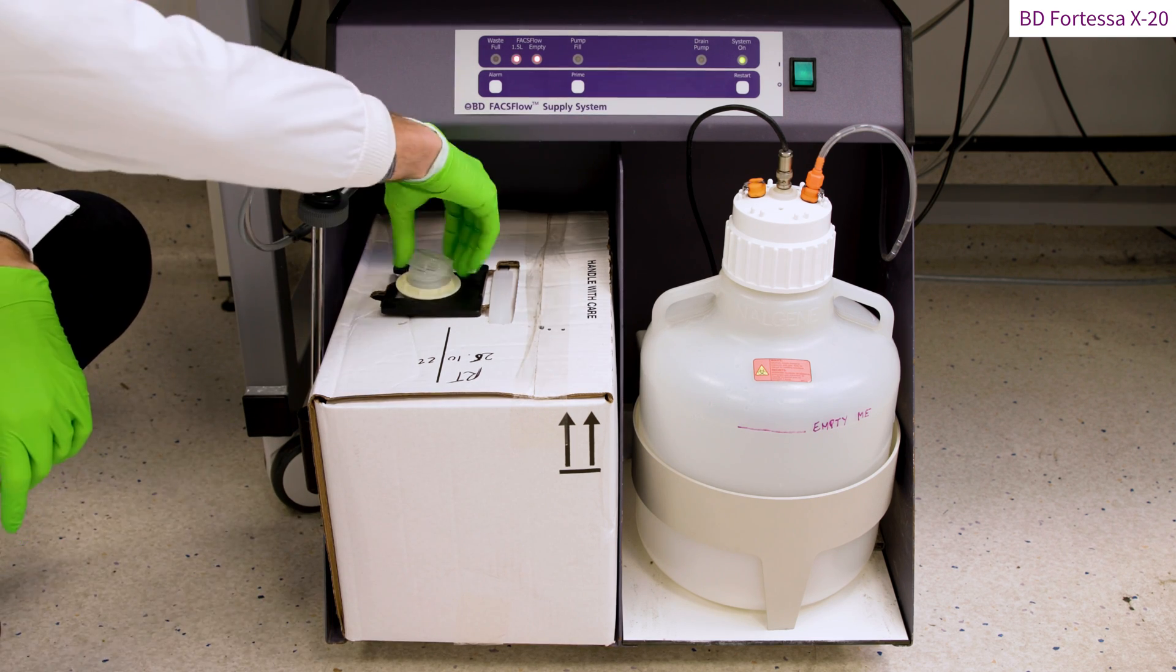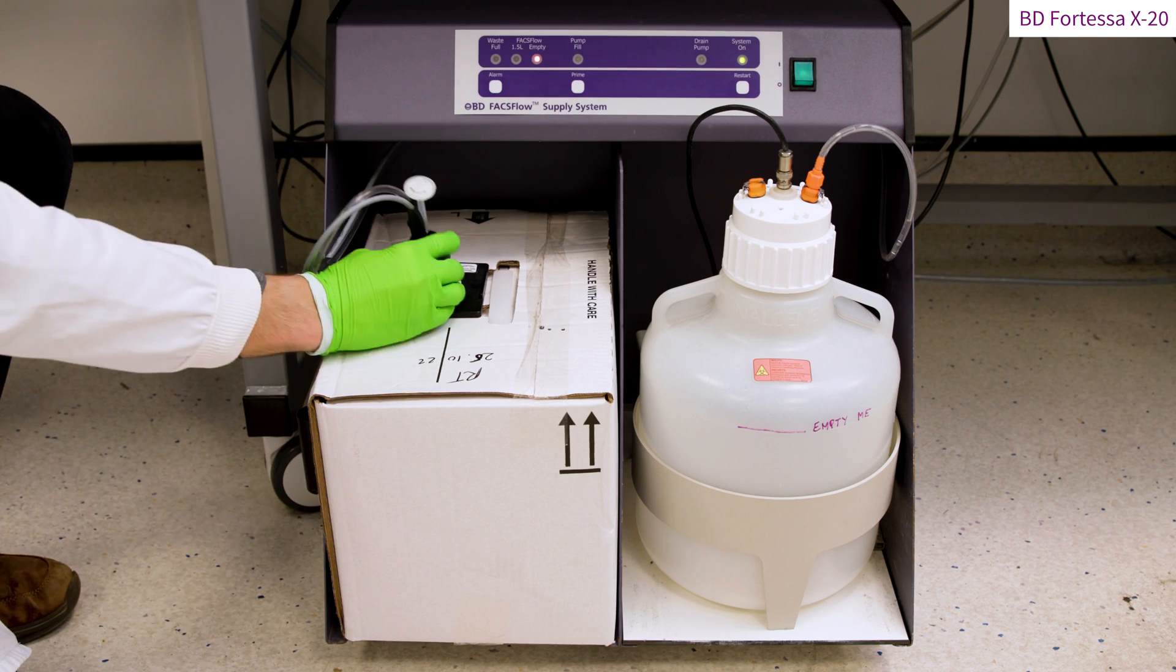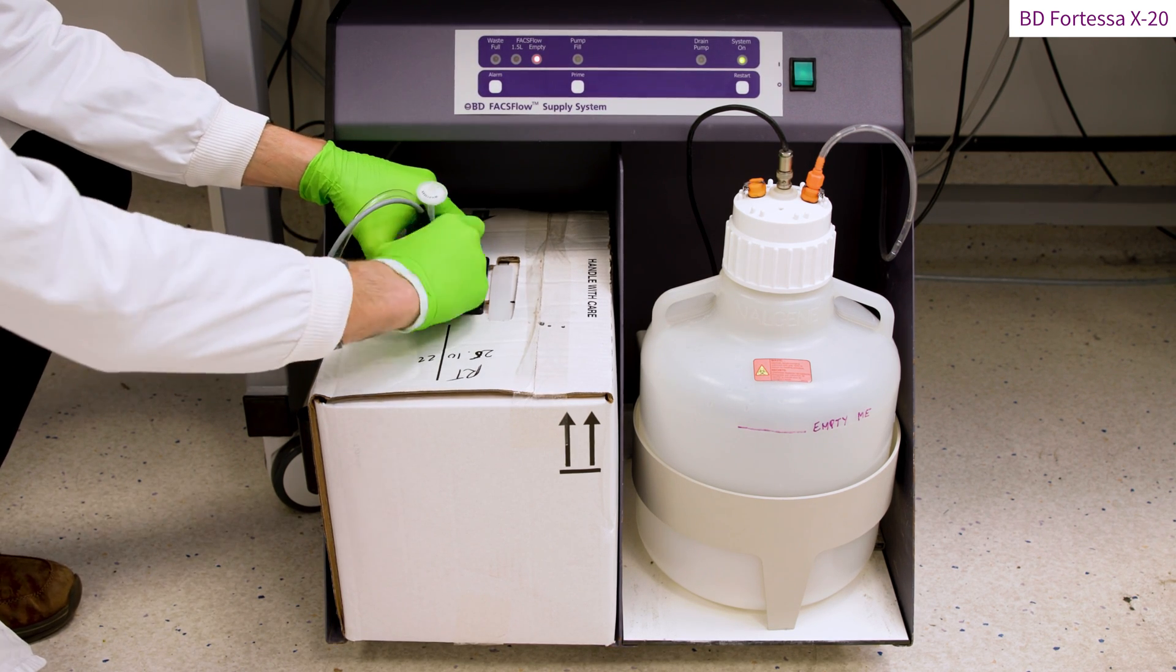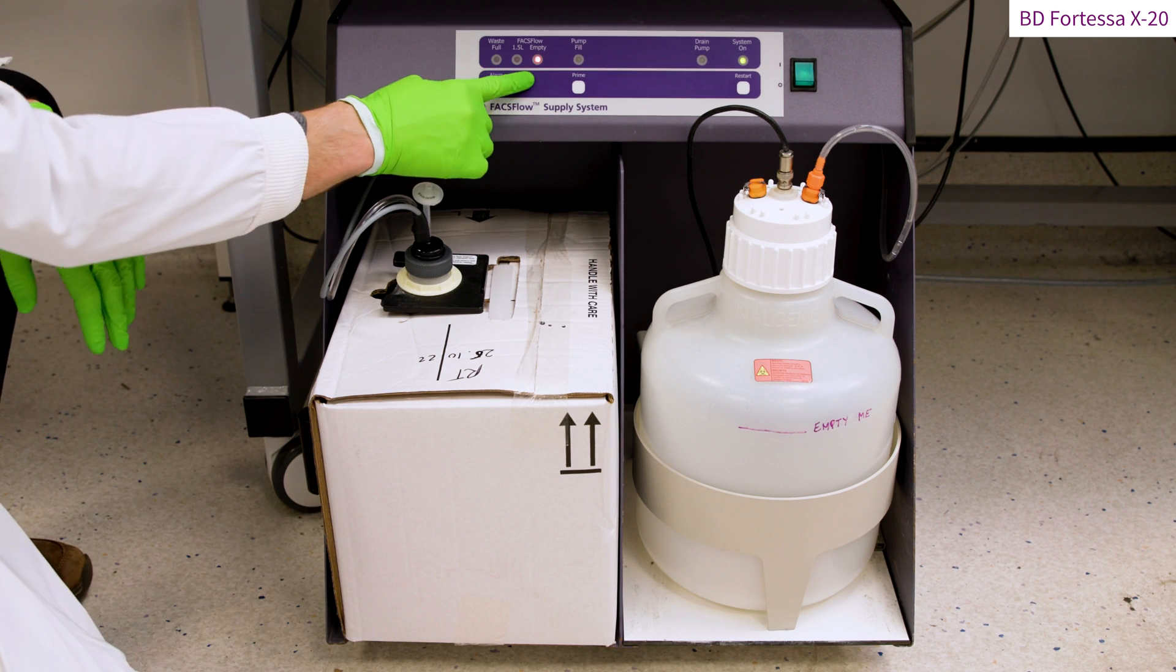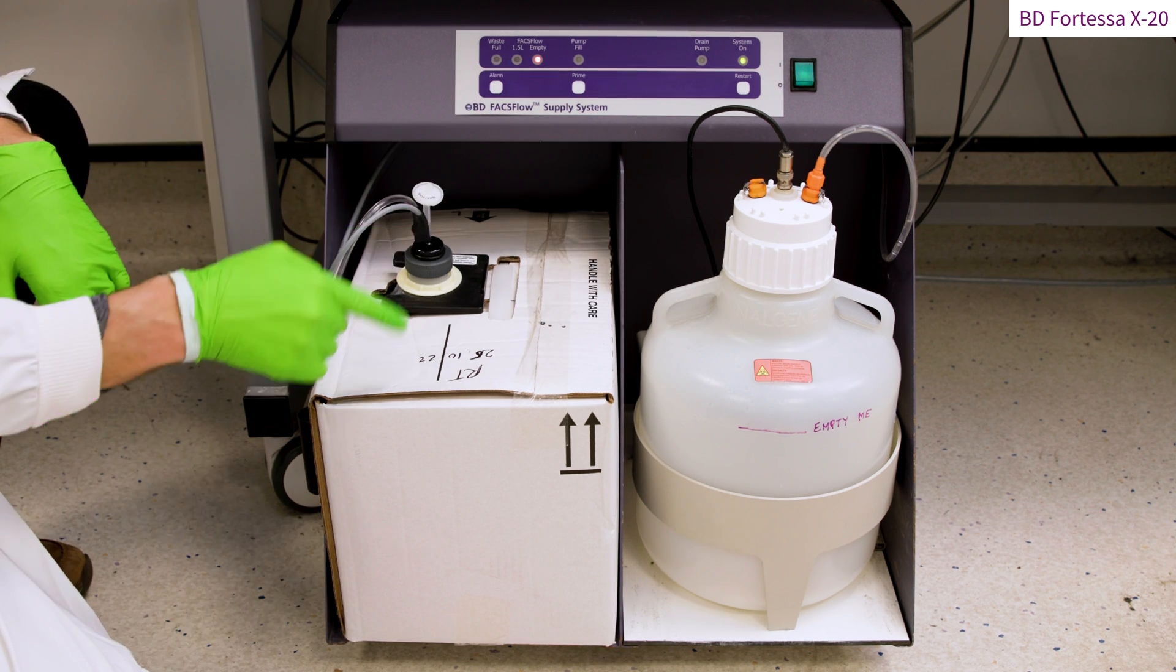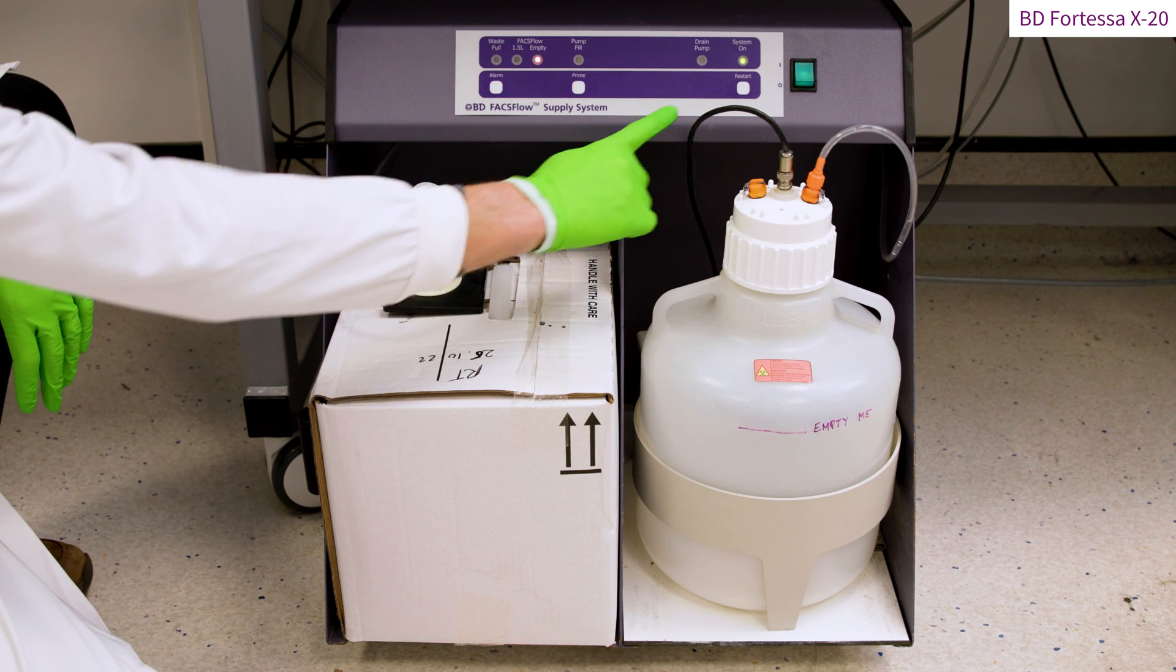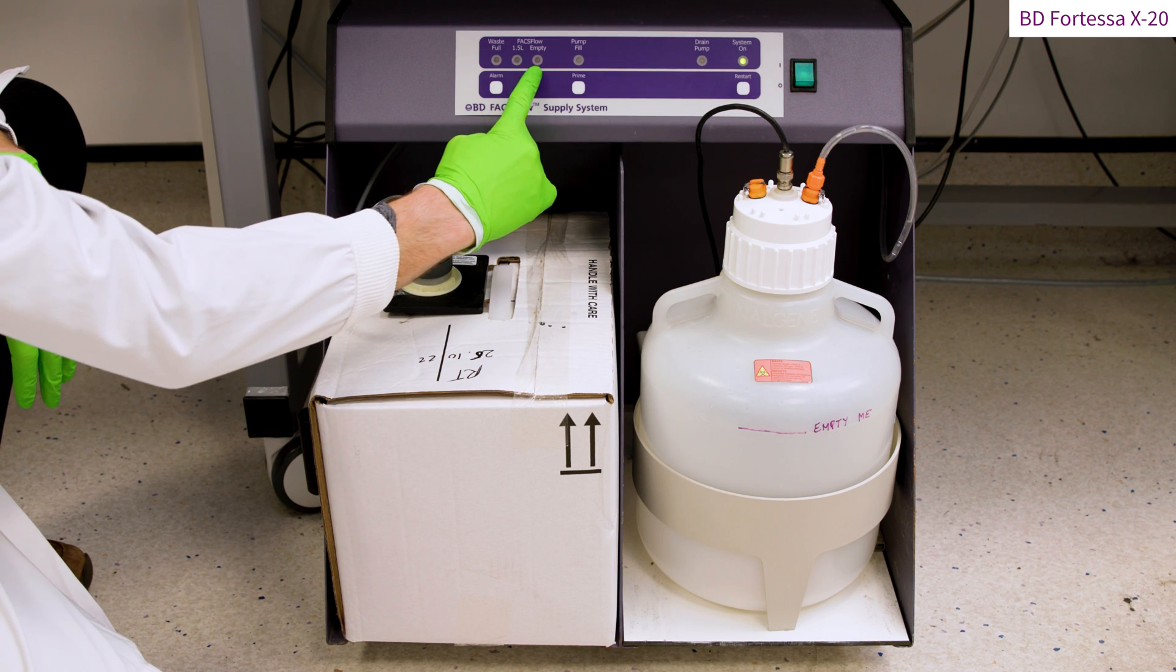Remove the security ring and unscrew the lid. Insert the probe into the container and screw it into the container. Note that the permanent red light indicating the sheath fluid tank is empty is still on. This indicates that the fluidic cart is on standby mode. The active pumping mode must be reset by pressing the restart button.